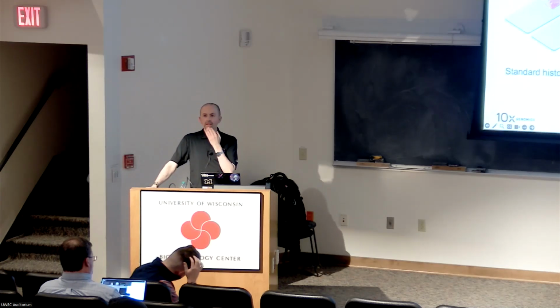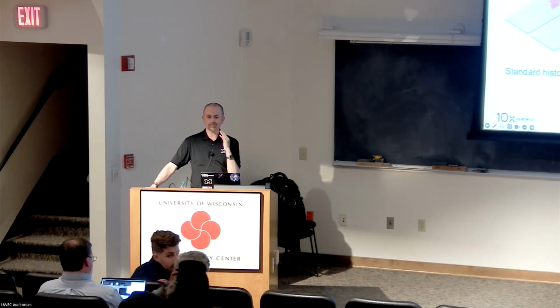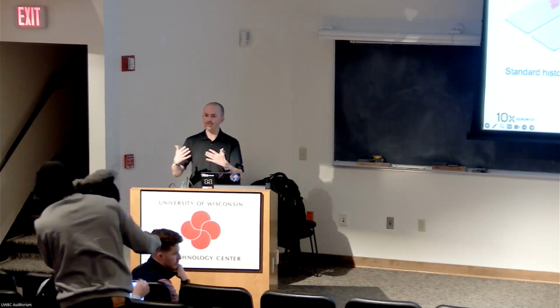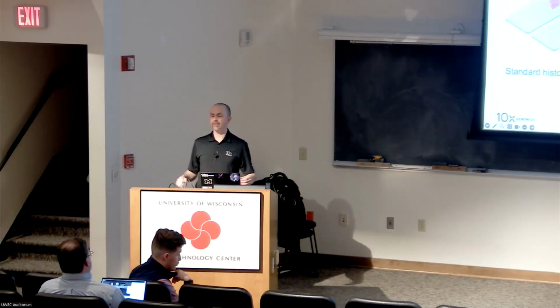We generated spatial data from bone. The tissue would need to be decalcified. There are different strengths of decalcification depending on the type of tissue and how much bone is there. But yes, it can be done.